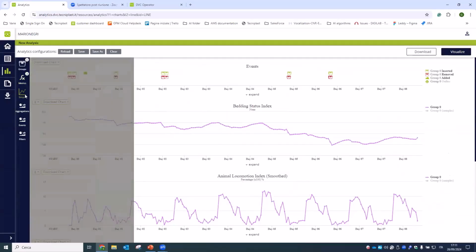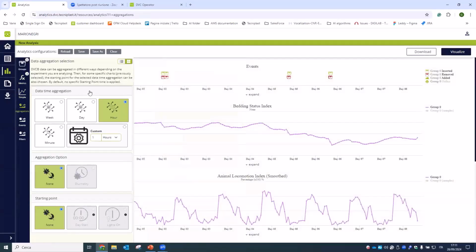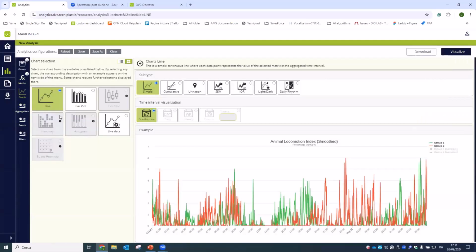So more than deepening the different configurations, my real suggestion for you, as a rule of thumb: whenever you have a triangle, please carefully check the triangle, because there is something stopping you to proceed.